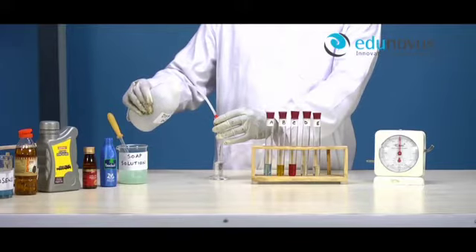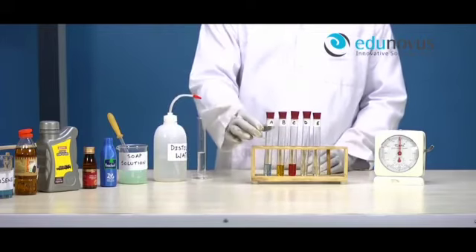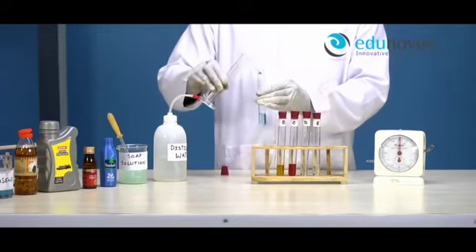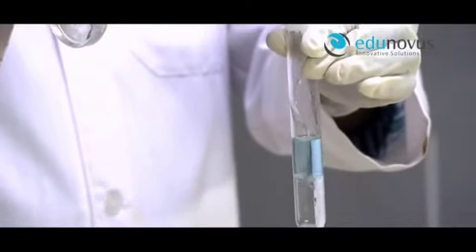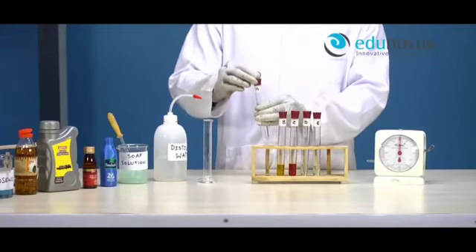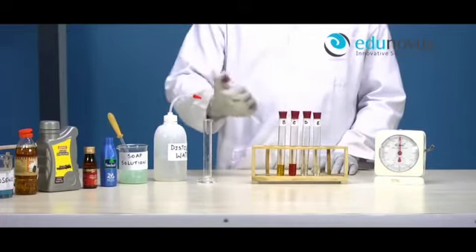Now add 20 ml of distilled water to the test tube A. Shake it vigorously for a minute and then allow it to stand.